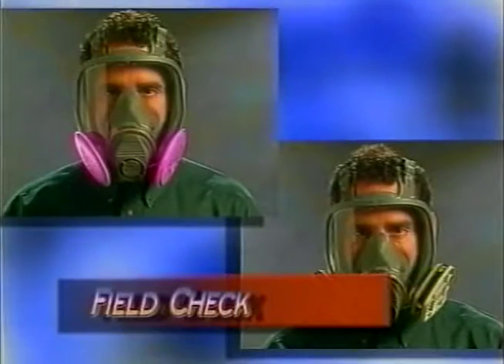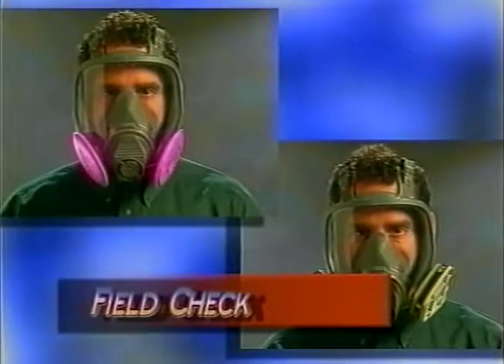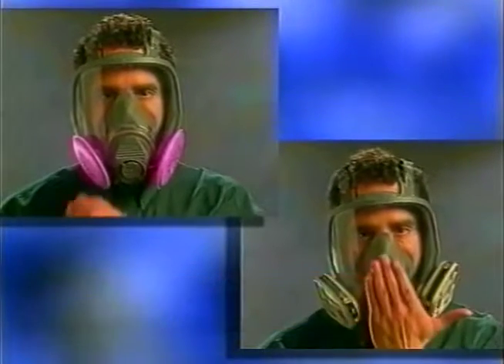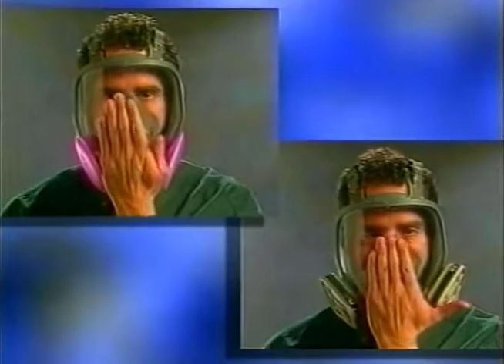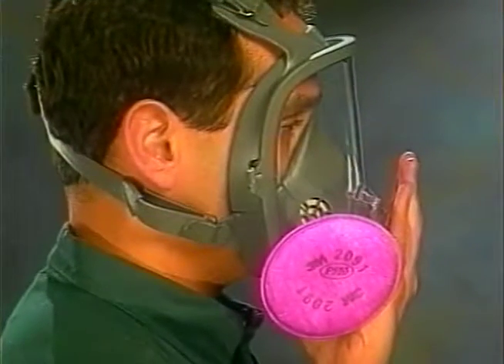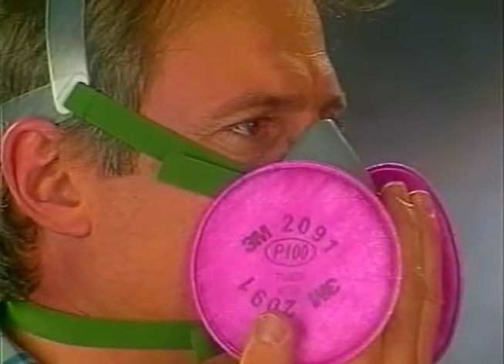Before entering an area where airborne contaminants are present, a field check must be performed. Start with a positive field check. Place the palm of your hand on the exhalation valve, being careful not to apply too much pressure as to break the facial seal. Gently exhale. If the respirator slightly bulges, without detecting a leak between the respirator and your face, the adjustment is fine.